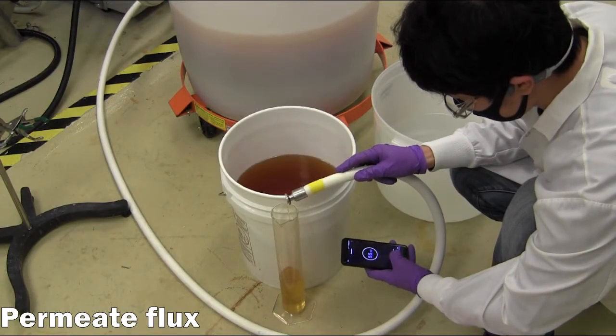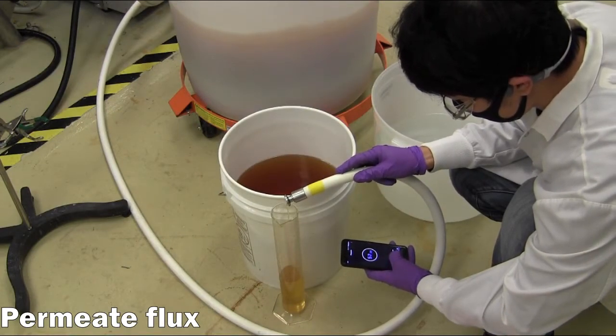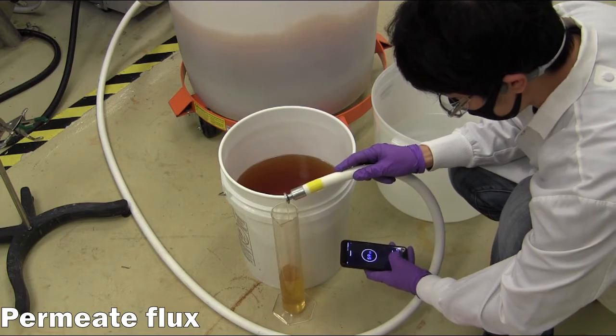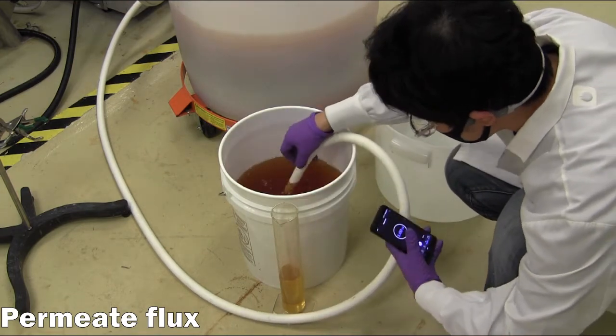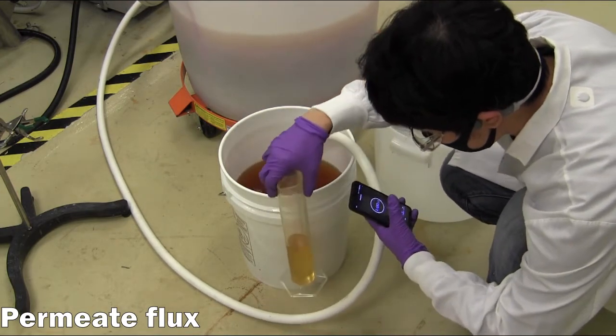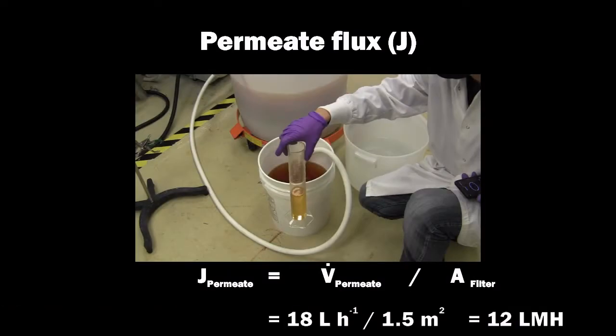The permeate flux is measured throughout the processing to monitor potential fouling of the membrane. As before, the permeate stream is collected over a given time interval and converted to a flux value using the membrane filter area. Here, the permeate flux is measured at 12 liters per square meter hour.